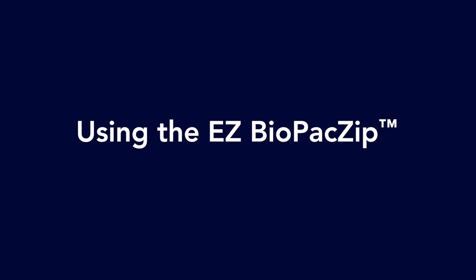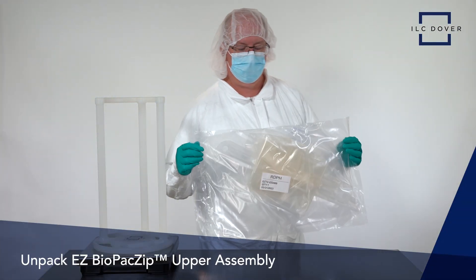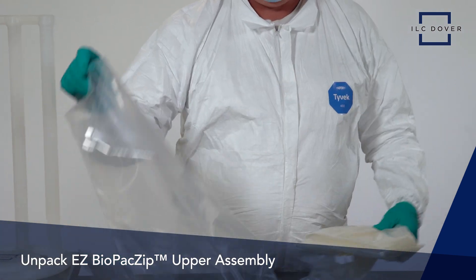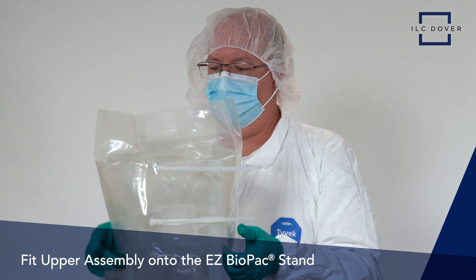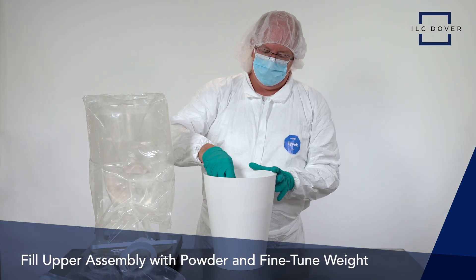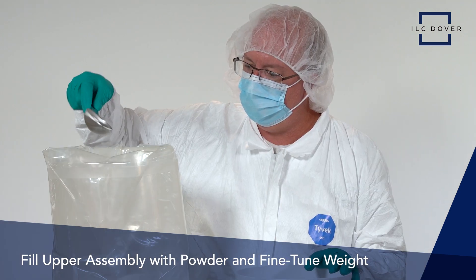How does it work? Let's look at how easy it is to use. First, unpack the EZ Biopack Zip upper assembly, consisting of the EZ Biopack bag integrated with a zipper and transfer ring, and fit it into the EZ Biopack stand. Fill the upper integrated assembly with your powder of choice in a fume hood or biosafety cabinet and fine-tune to your precise target weight.